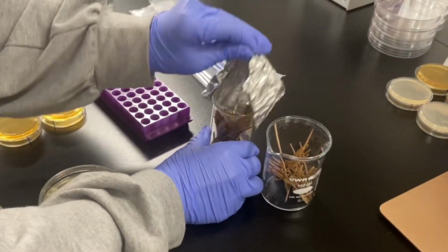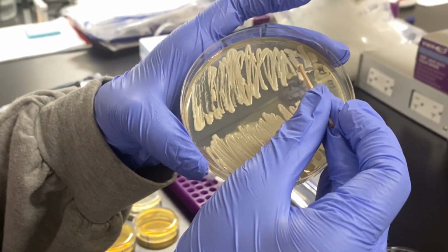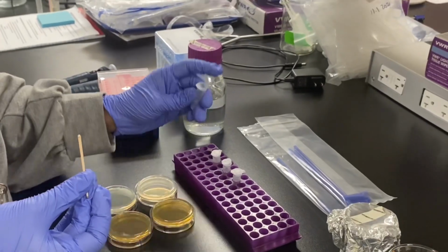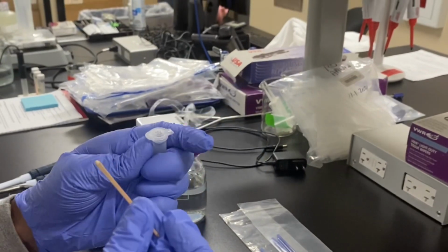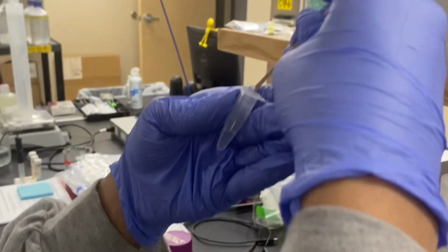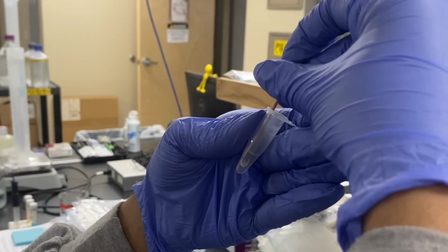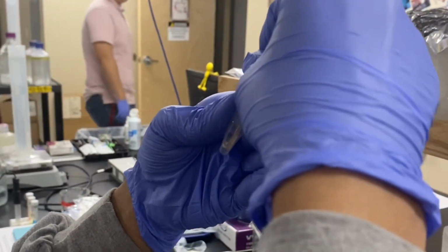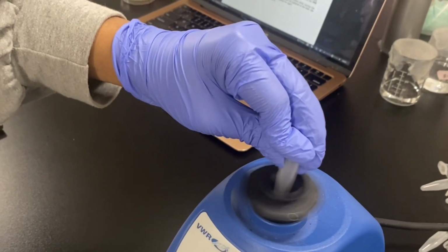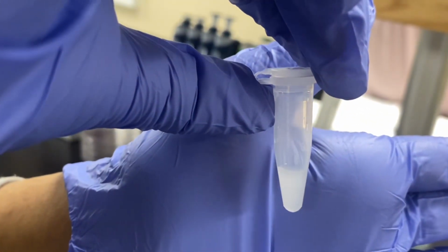Using a sterile toothpick, gently obtain a pin-size amount of wild-type yeast cells. You can see the amount demonstrated here. Submerge this into tube S0 or tube 1 containing 250 microliters of sterile water. Spread the culture inside the sterile water along the edge of the tube until most of the cells are off the toothpick. Vortex tube S0 or tube 1 to mix the cells fully in the sterile water. This tube should have a cloudy appearance.